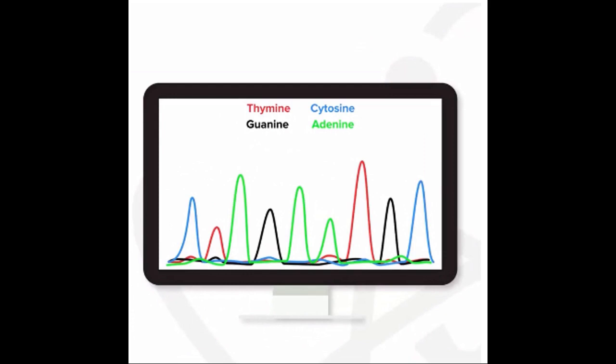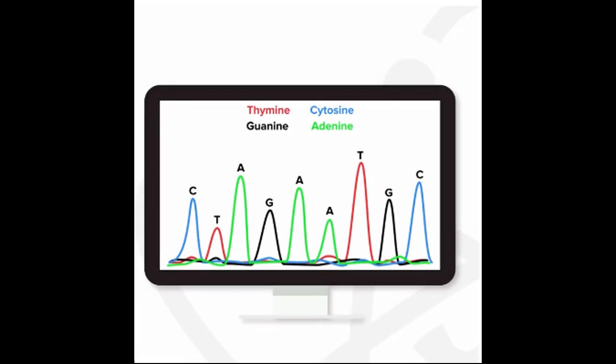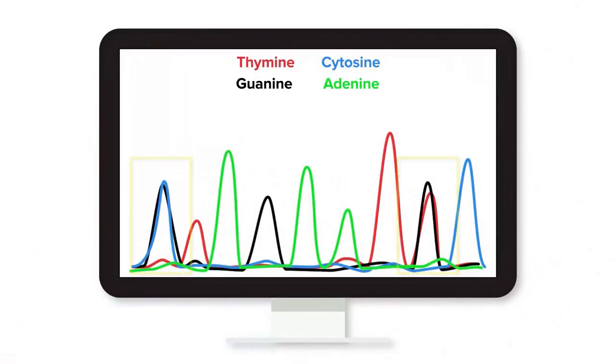The DNA sequence displayed on the screen is CTAGAATGC. Sometimes it's difficult to interpret a nucleotide peak since there are places where the peaks may overlap. This is particularly common at the beginning and the end of a sequence. These ambiguous places are often labeled with an N rather than one of the 4 nucleotides.